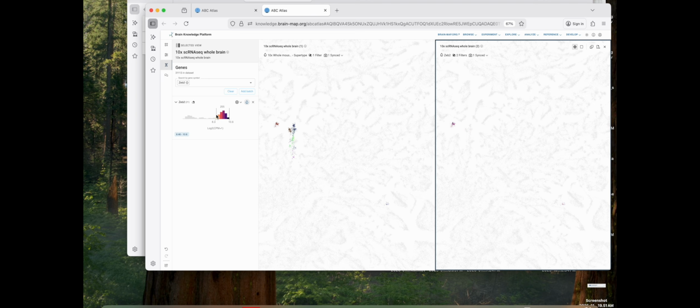You can see this middle blob basically vanishes, but we still have our two interesting island supertypes. So we have successfully, I would argue, found a marker gene for those two supertypes. This is the kind of analysis that we hope to enable with ABC Atlas Access. This is why we want to give everyone access to the data behind ABC Atlas, so you can do these kinds of deep dives and help further your analysis of this massive data set.